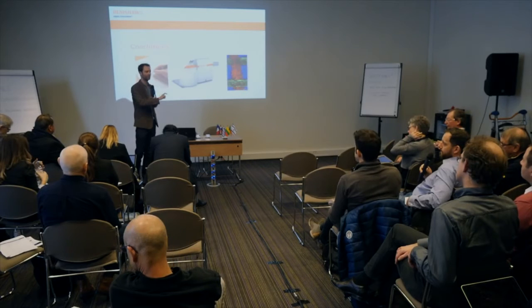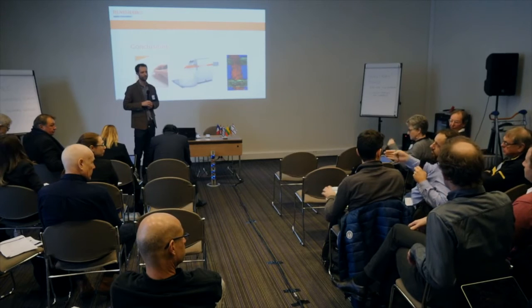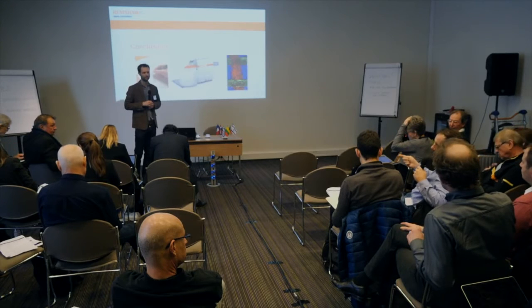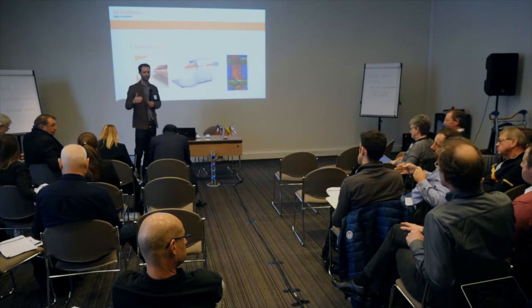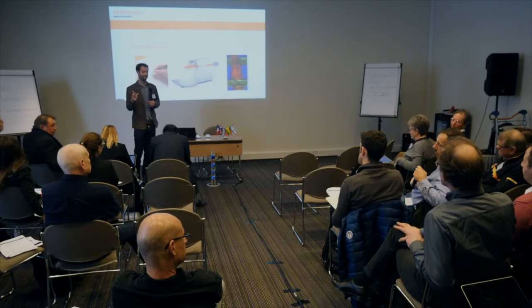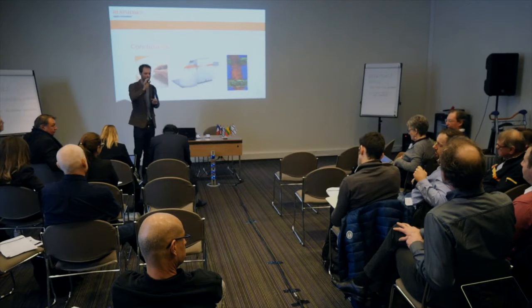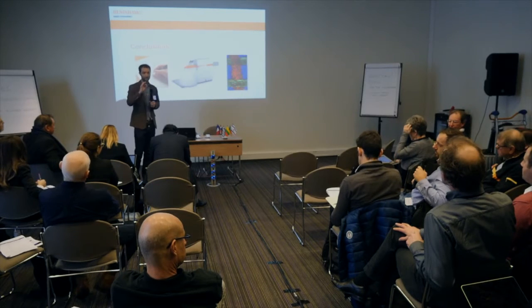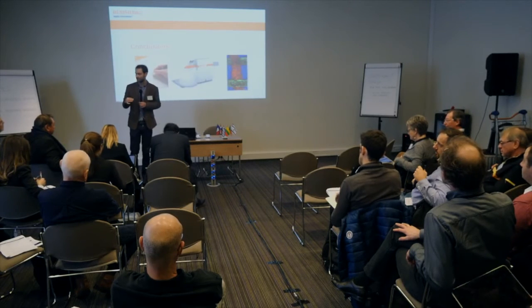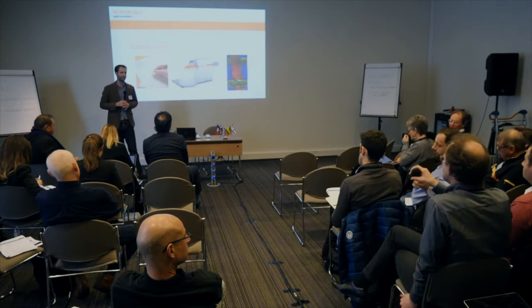But if you move the sample from one instrument to another, 5 micron is... I don't know what the limit could be. I mean, the limit is being able to get it in the field of view of the camera. Going from one system to another, there would be a mounting that needs to be very reproducible, which might mean expensive, because we've got some kinematic mounts with extremely precise repositioning, but that means each sticky pad needs to be installed on such a mount, which probably adds to the complexity of the system.